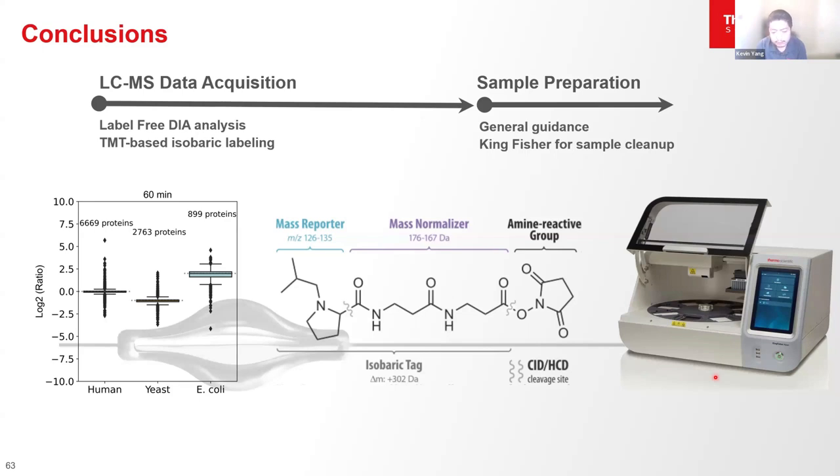And in terms of quantitation, I come from the mass spec world, so I trust the results from mass spec better because I can see the raw data and I can see those fragment ions. But it's just my opinion. Olink uses antibodies to amplify the signals, and I'm not familiar enough with the technology. I don't know how they determine the LLOQ, LLOD after amplification. So that's kind of the question I'll ask them. How do we evaluate the quantitation accuracy from that new technology?